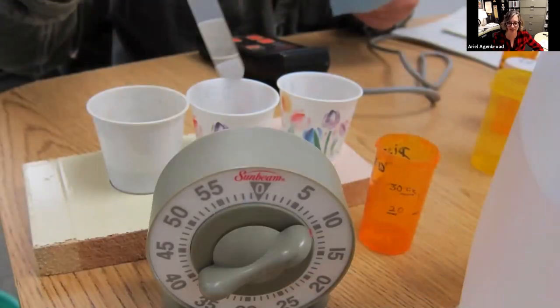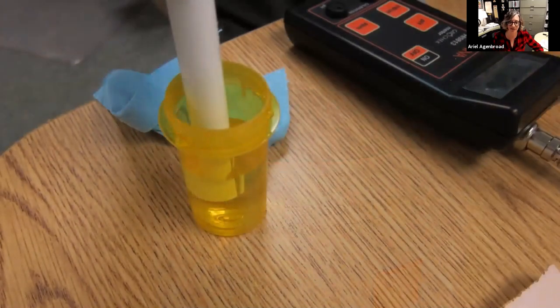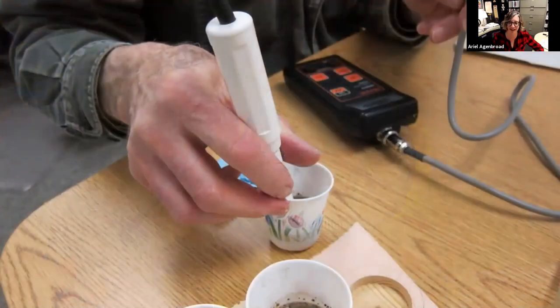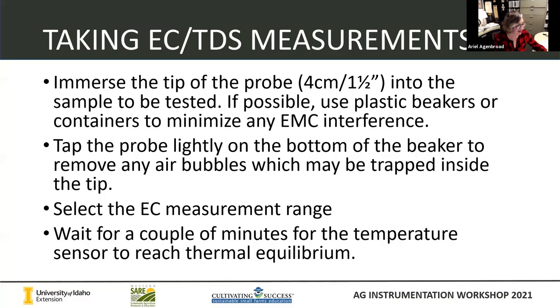If you don't have a fancy stirring stick, plastic spoons often work very well. Let it equilibrate a while — let it kind of come to room temperature — and then test it. Here, using your buffer solution: anything will work. This is a great way to conserve your solution. He's using an empty pill container. We always have a bunch of thermometers around our offices — we use them for all different kinds of things like soil temperature and testing the temperature of our solution for pH. You can see he's calibrated in that 7.01 solution, then puts the probe in the soil sample. In this case we've got an 8.0 soil, which is very typical for the Nampa-Caldwell area.